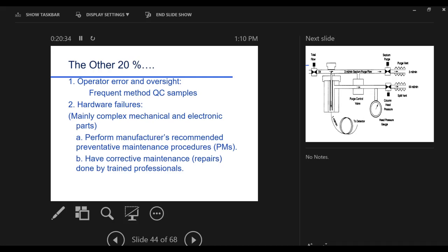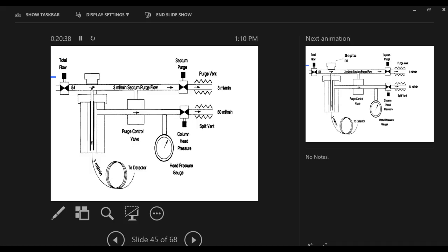90% of our problems occur back at the injection port at the very start of the whole run. They're up here. So here's our injection port. Here's where we put our sample in. I'm making a connection up here. I'm putting this rubber septum up here. Well, how often do you change your rubber septum? You keep on injecting, you're poking holes with that injection needle up here. Is it going to leak? It's going to leak sometime. Well, you better think of that before it leaks. So move ahead of strategy and plan for how often you replace that seal up here. There's another seal down here. We've got the glass to metal. There's a rubber o-ring that goes around this glass that makes a seal. I've taken those things off and they've almost been ashes. They've been dust. They've been in there so long under that heat. And nobody's ever looked at them. If you don't get a seal here, you get leakage out of this system.